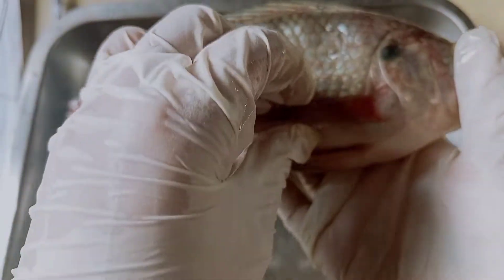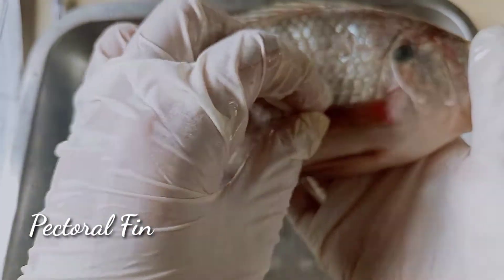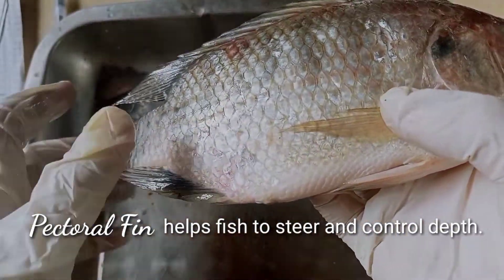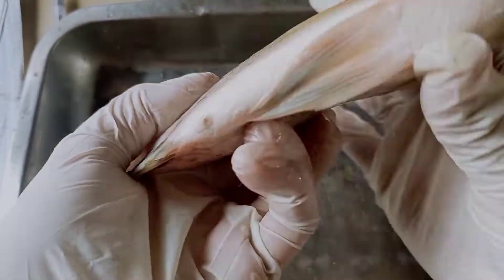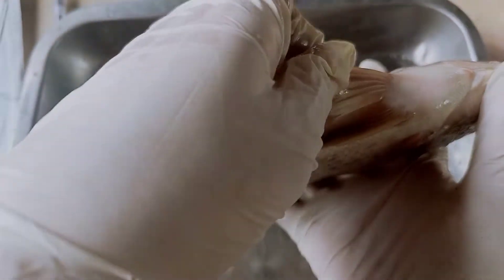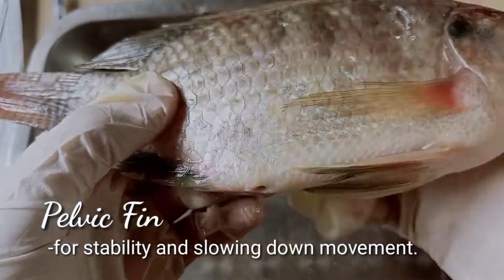This is their pectoral fin. The pectoral fin helps them steer and control their depth in the water. And this is their pelvic fin — it helps in stability and slowing down the fish.